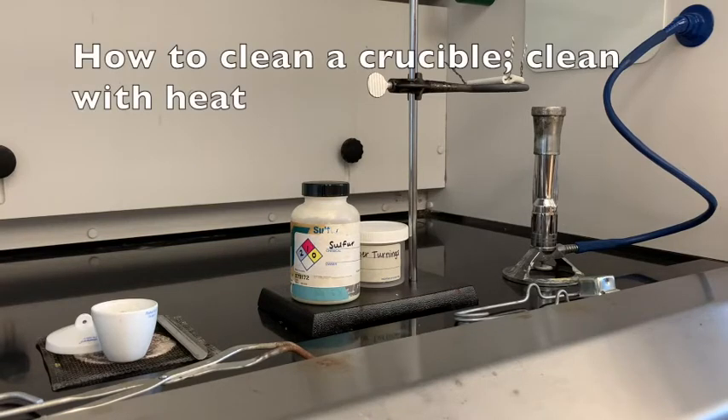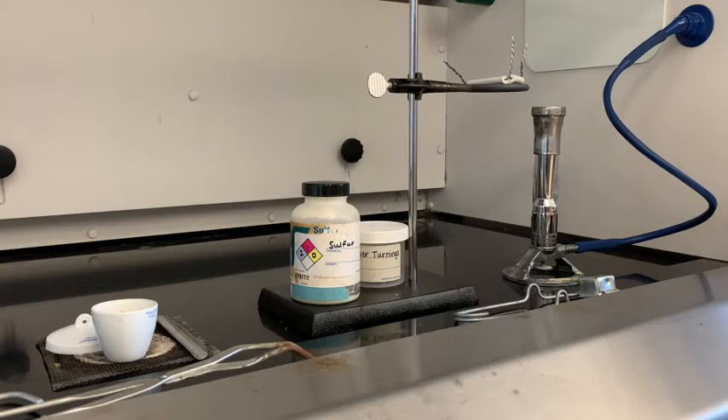The first part of this lab is going to be cleaning the crucible. To clean the crucible, which is porcelain, we're going to heat it up — heat it till it kind of glows red — and then let it cool off. We're going to use the Bunsen burner to heat it, which will burn off anything left over from any other reactions.